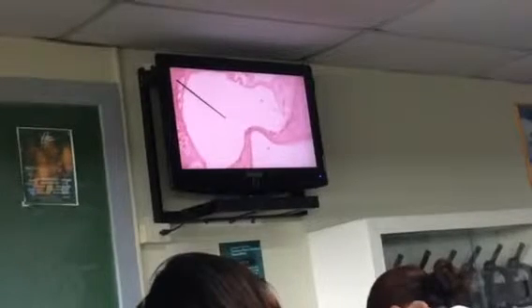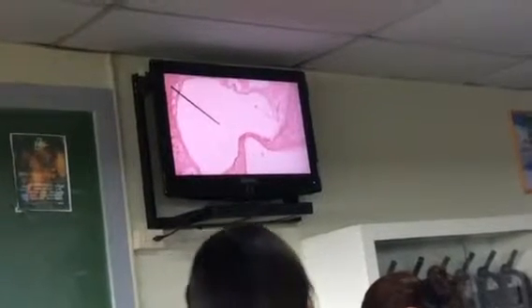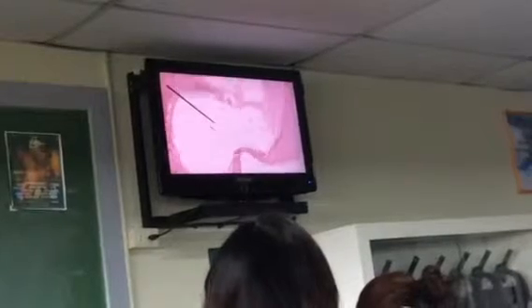So this basilar membrane over here. Okay, yung entire na yan is basilar membrane and this is Reisner's membrane. Okay. Scala media is actually equivalent to what we call cochlear duct. This is cochlear duct. And therefore, the scala vestibuli and the scala tympani are both occupied by perilymph. Scala media, on the other hand, is occupied by endolymph.